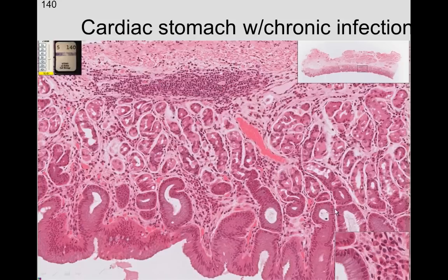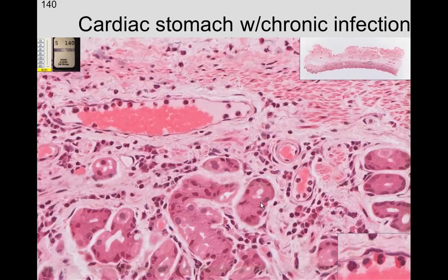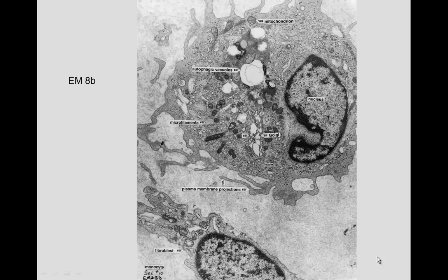Looking at a cardiac stomach with a chronic infection, we can see lots of white blood cells. At higher magnification, there are many plasma cells, which produce antibodies to help neutrophils phagocytize the pathogens. In a blood vessel, many cells are marginating — attached to the venule wall — and will migrate out into the region of chronic infection.